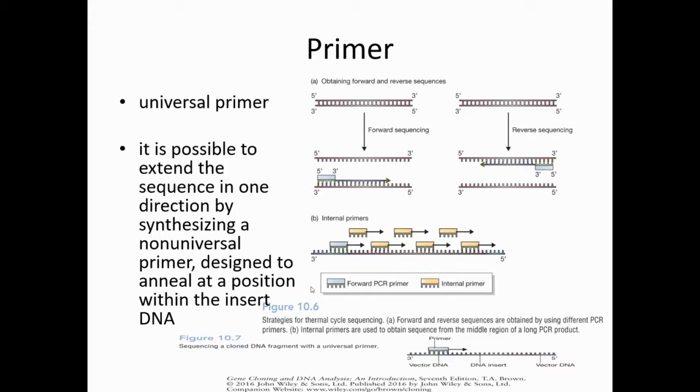Okay, if you design a primer inside the inserted DNA, that will become the internal primer. But those internal primers will be based on the sequence of the DNA molecule that you use.